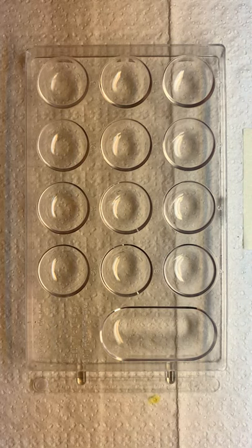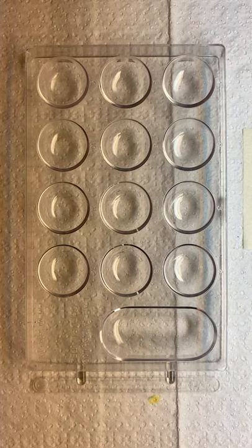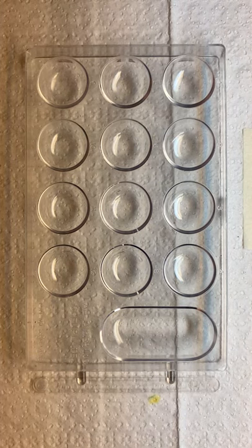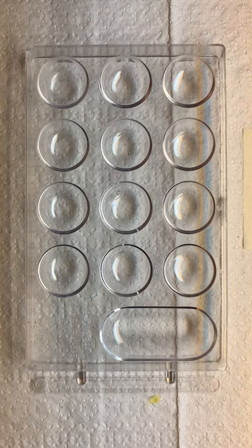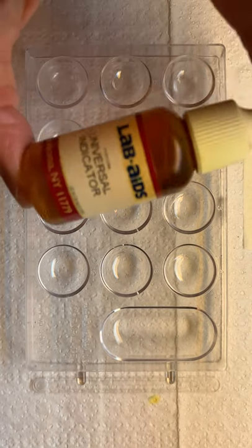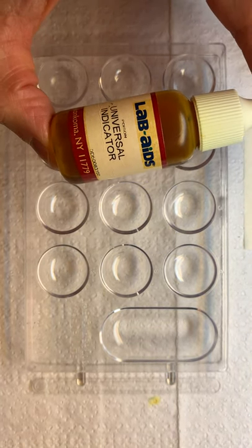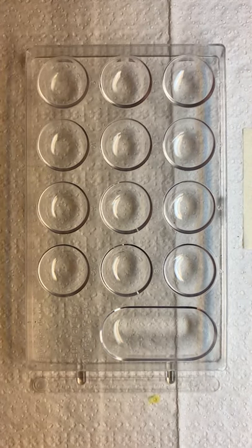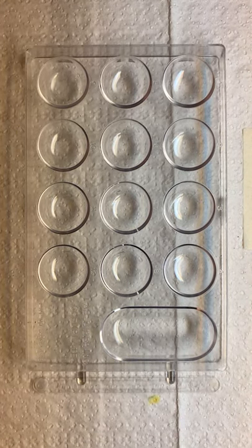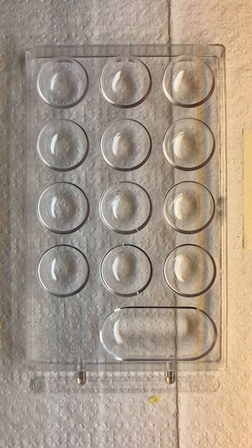So Activity 3 is called determining a color standard, which means a key or a guide, using the universal indicator. Now we're going to switch over from those bromthymol blue and the methyl orange and the phenolphthalein to this thing called the universal indicator. You remember that this one has the full range between 0 and 14. But again we only have the odd numbers so we're going to test the odd number ranges.